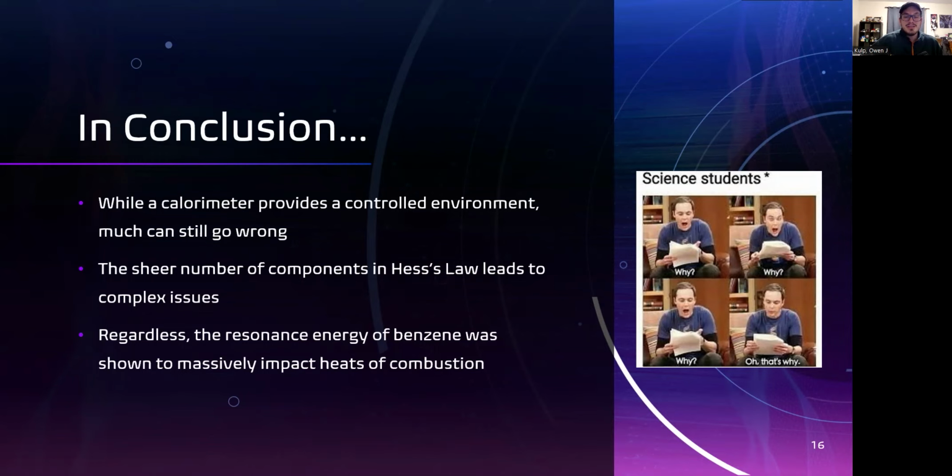Finally, both in the literature value and in our experiment, the resonance energy of benzene proved itself to be a major contributor to the heats of combustion for cyclohexane and CDDT.